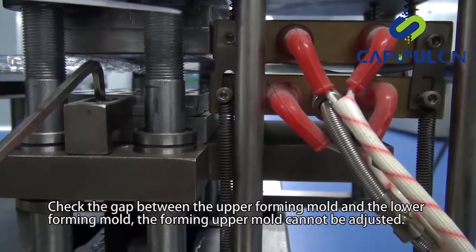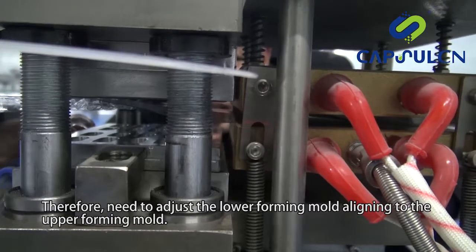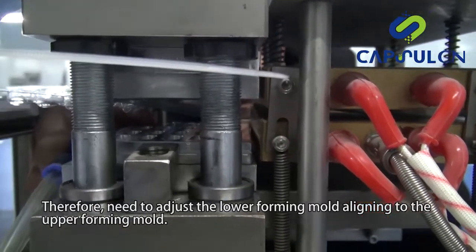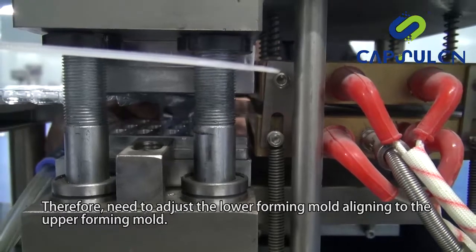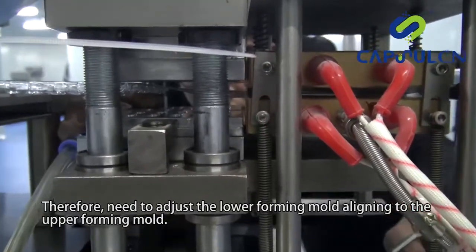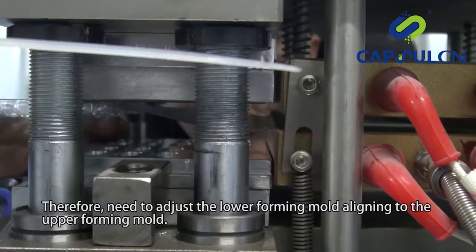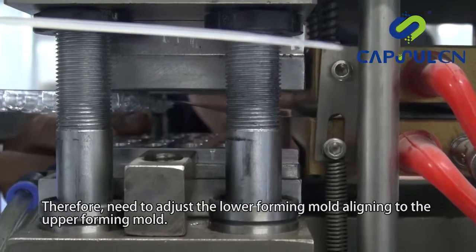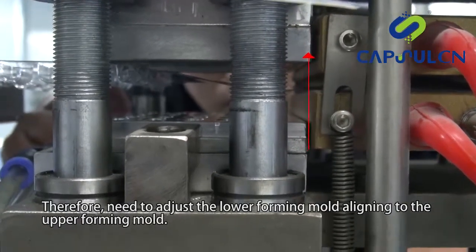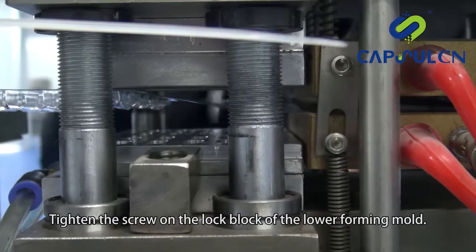Check the gap between the upper forming mold and the lower forming mold. The forming upper mold cannot be adjusted; therefore, need to adjust the lower forming mold aligning to the upper forming mold. Tighten the screw on the lock block of the lower forming mold.